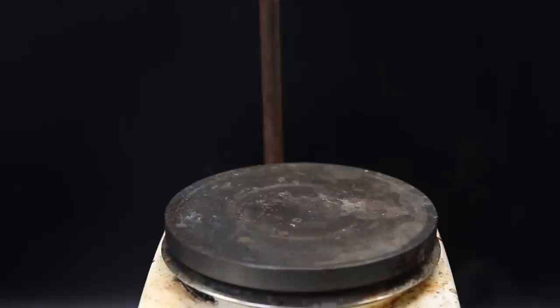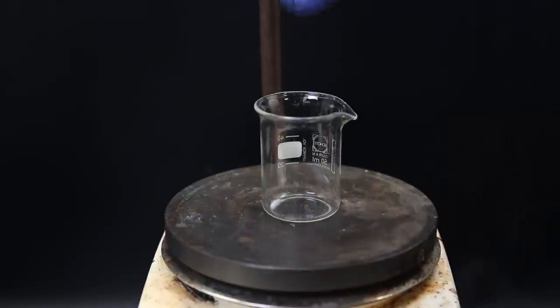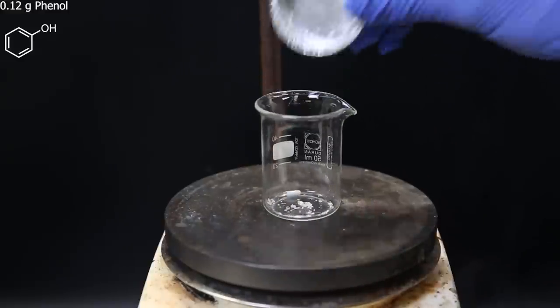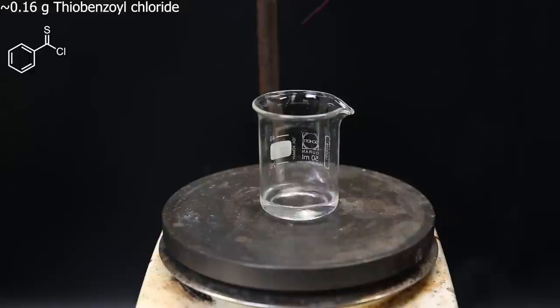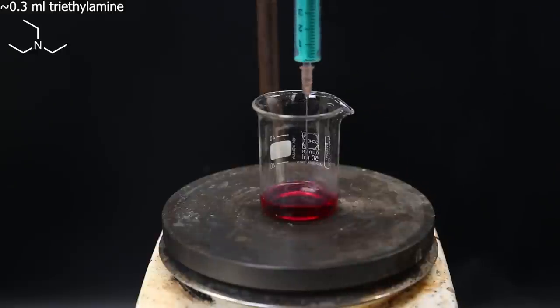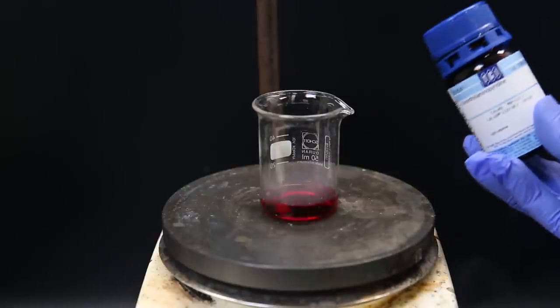So let's try it out. So I set up a small beaker, and add in a tiny stir bar. I then add 0.12g of phenol, 5ml of DCM, about 0.16g of thiobenzoyl chloride, and about 0.3ml of triethylamine.